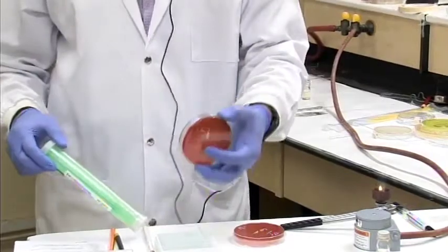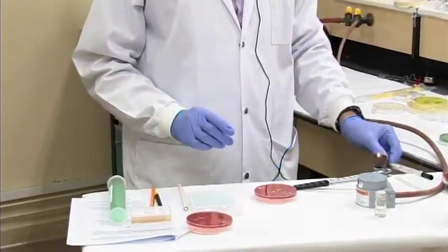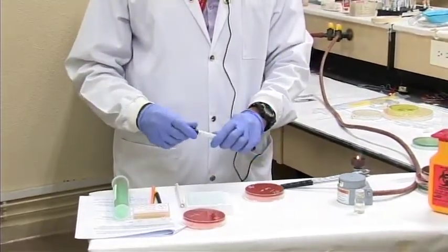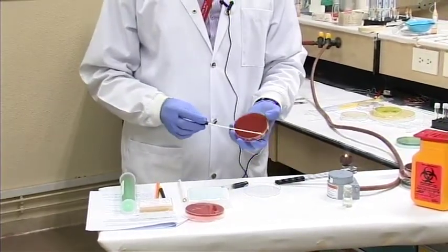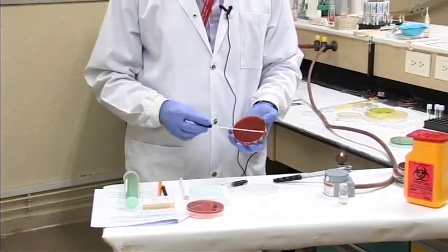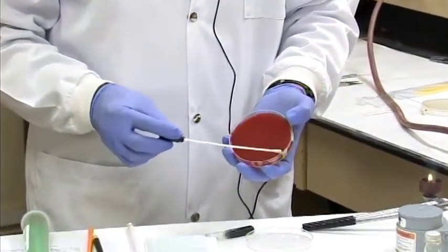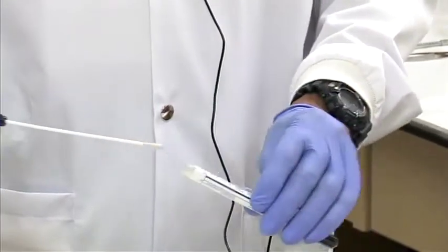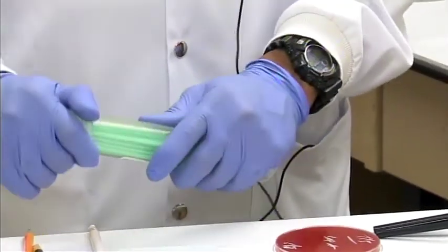Of course, we have a bacteria we're going to use. Let's say it's a throat swab, so we will use our specimen source here again. So we have our throat swab here. Again, we're going to open the plate and make an inoculum, rotating the swab, making a small pool. You don't want to make the pool too large because you're going to use up too much space on your agar plate. Once the inoculum is made, insert back the swab.